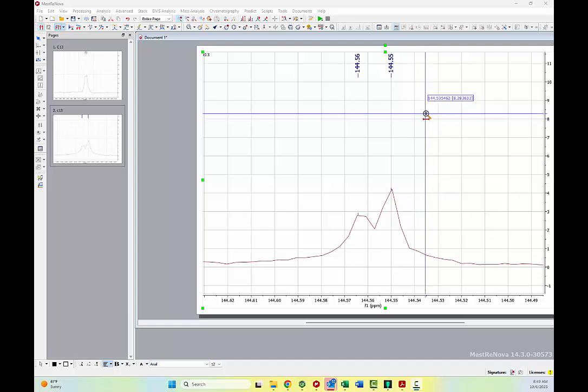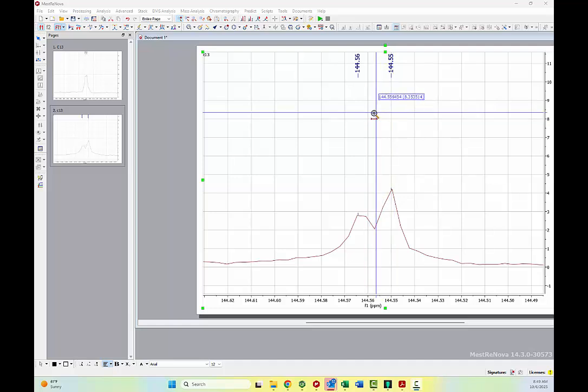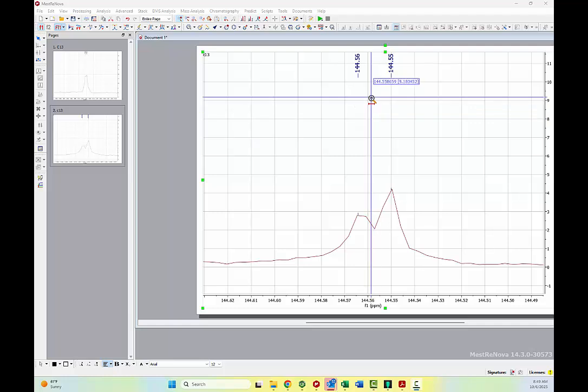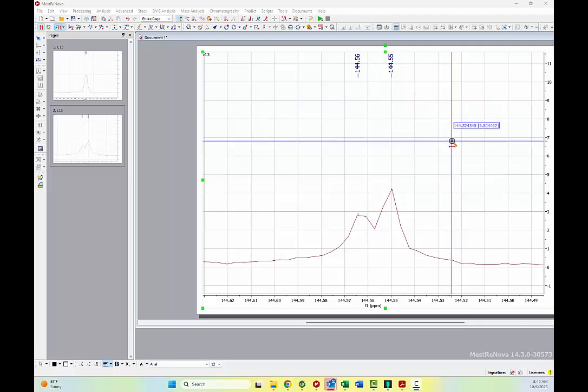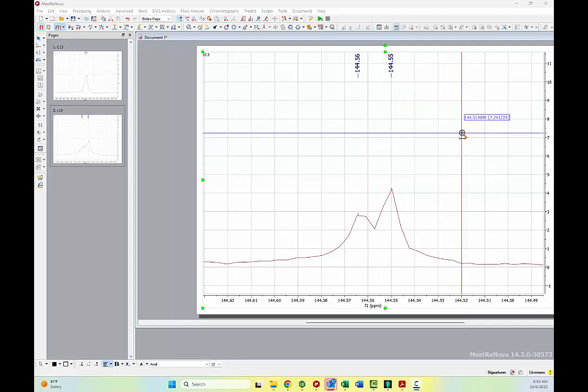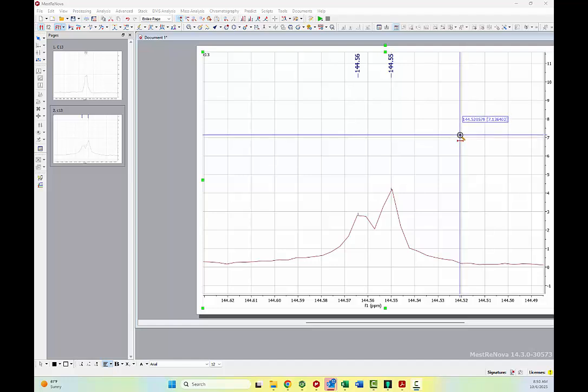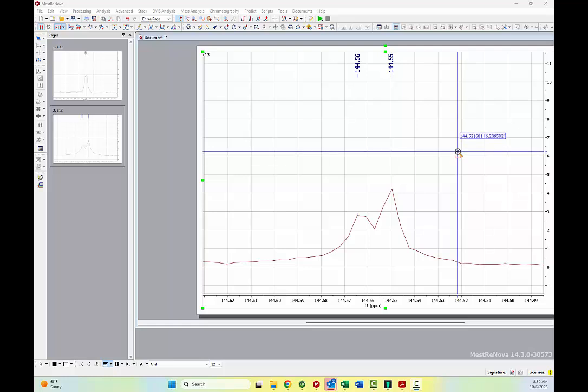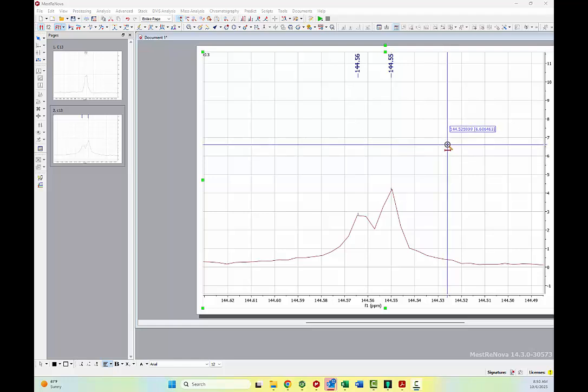And given the way that we tend to take these spectra, given the pulse sequence that we use to collect the data for C13 NMR, either this is two peaks that come exceptionally close to each other in the C13, or it's just some weird artifact and this really should be a singlet. How do you know which one's which? Well, ultimately, you really want to have some kind of independent piece of evidence that tells you which one is which. If your mass spec suggests to you that you have 7 carbons, and counting this as a singlet, you have 7 carbons, well, then that probably means it's a singlet.